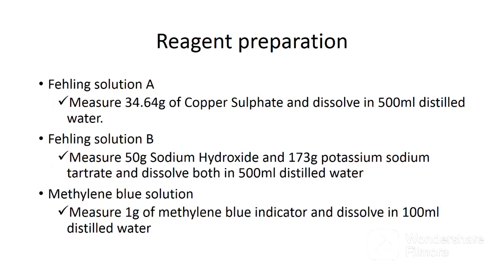Reagents must be prepared before doing the analysis. The first reagent to prepare is Fehling Solution A, which contains copper sulfate. To prepare this solution, measure 34.64 grams of copper sulfate and put it in a 500 ml volumetric flask. Add a small amount of distilled water and shake to dissolve all the crystals, then top up to the mark with distilled water.